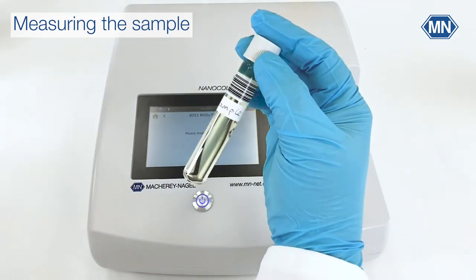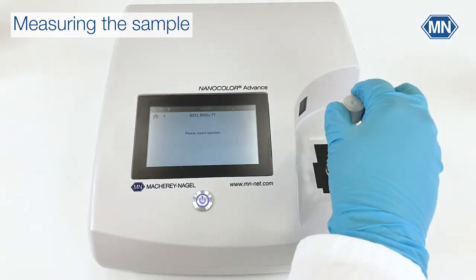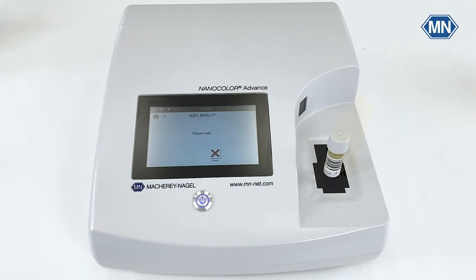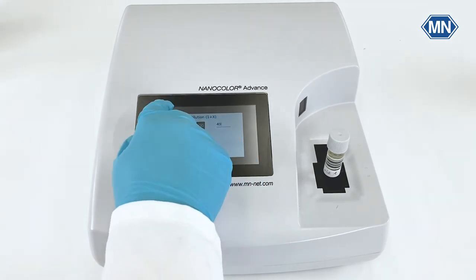Take your sample tube and clear it from the outside. Put it in the photometer and press measure. Enter the dilution factor and the device will show the BOD5 of your sample.